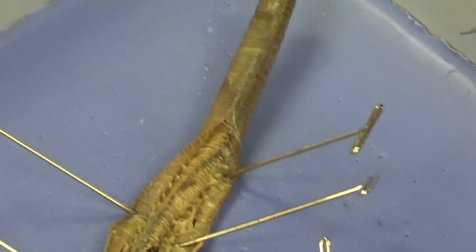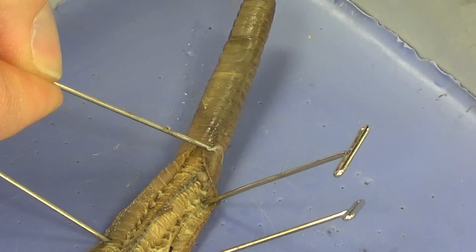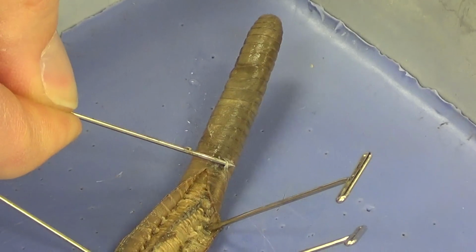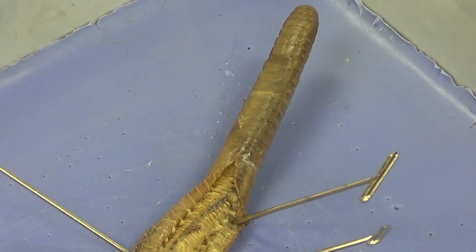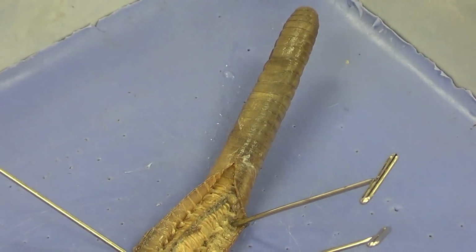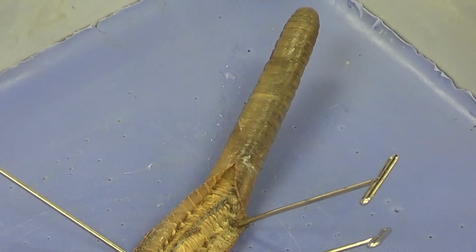Now you can see right here this saran wrap-like material beginning to appear. I've got a pin right underneath a little bit of it here. And this saran wrap-like material, you can see it right there, is simply the cuticle. And that cuticle is going to be responsible for protecting the earthworm, both in terms of dehydration a little bit and in terms of protecting it against abrasion as it works its way through the soil.